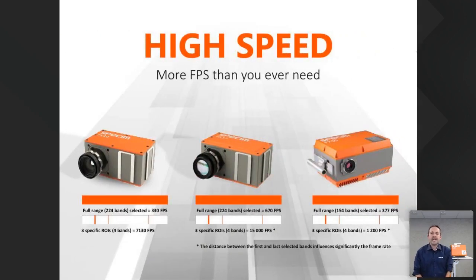Also, a key parameter of those cameras is the capability of picking only the wavelengths which are relevant for your application. Let's take a typical example. You want to work in an application where, with the FX50, you don't need the full spectrum, remember, from 2.7 to 5.3 micrometers. You know that you only need data between 3.3, for example, or 3.5 micrometers. It is possible to disregard what lies before and also beyond the spectral range of interest.